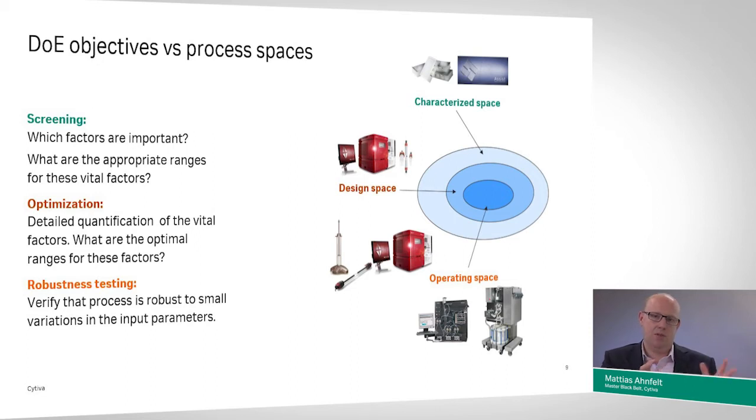Naturally, the next step is to verify that conclusion. And also on a process development timeline, we would encounter a scale-up sooner or later, definitely a scale-up also, where again, we verify that the conclusions from the smaller scale are valid also in the larger scale. Robustness testing DoEs are very useful for the purpose of addressing those questions.